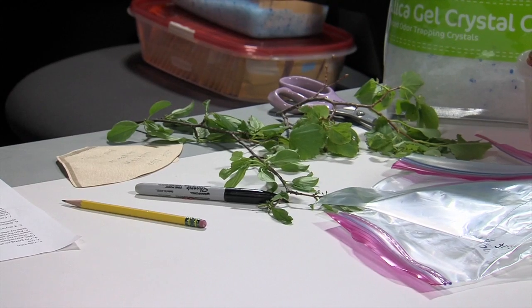Make sure you understand which part of the plant must be collected for DNA. Typically, this is young leaf material, but it may also be buds, flowers, or something else. You also need to understand how to do the sampling. Have you been asked to collect plants from a single population or multiple populations? How far apart should these populations be? How many individual plants per population? And then how far apart should those individual plants be? Some plants are clonal, and if you collect them too close together, you may be resampling the same plant.